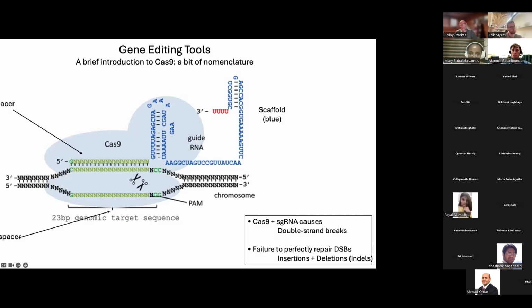If it's the opposite strand that you put into the program, it will give you, for example, ACC, right? So it's not the TGG PAM region, but ACC. The program I'm using is CCTop, and it works fine for me. It gives me the off-targets, and I didn't have to go further, and it's okay for now.